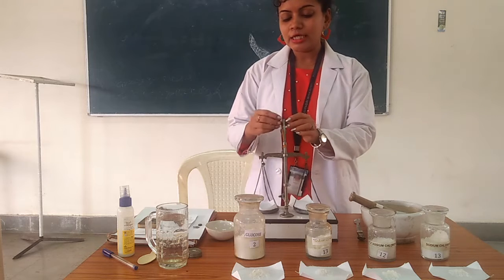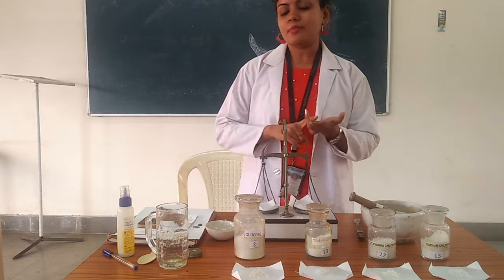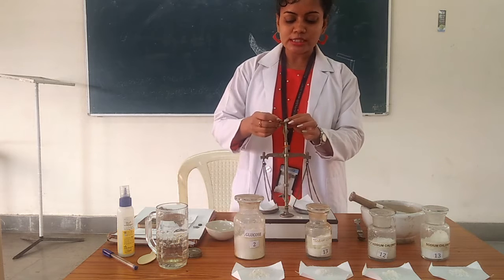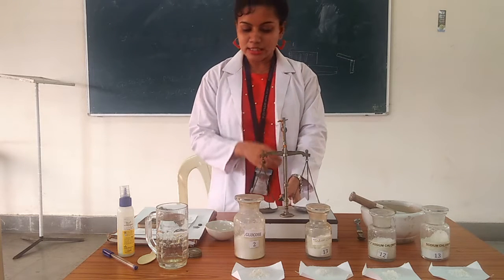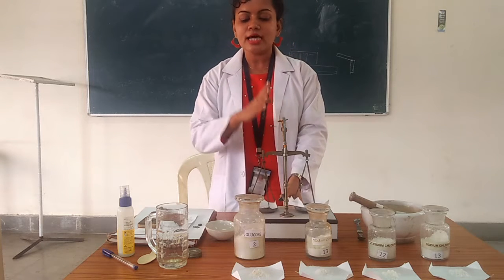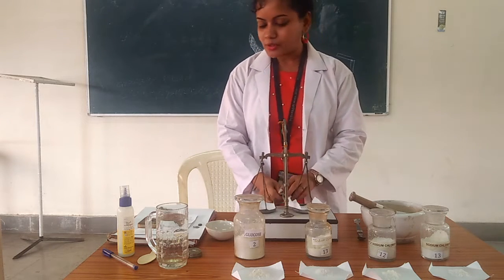Before starting our preparation, we check the balance. We can use a common balance, analytical balance, electrical balance, or electronic balance. Here I am using a common balance. First we check whether it is in the equilibrium position — that means the central indicator crosses equal distance from left to right. We adjust the balance to equilibrium position first.